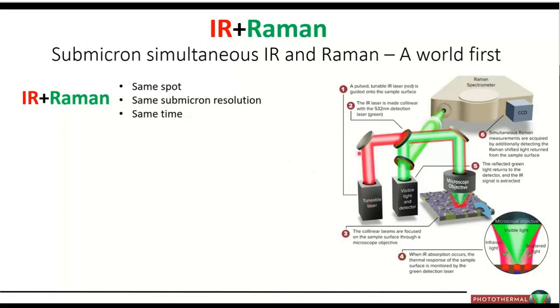And very quickly, I'll take you through the schematic here. So this is our infrared laser again. We shine that through our objective, this reflective Cassegrain optic that focuses the infrared down onto your sample. At the same time, as I mentioned before, we introduce the probe beam, a green beam typically, and we focus that down much more tightly, of course. Let's zoom in here. That's where that photothermal magic happens as we sweep through our wavelengths in our QCL, and that reflected green light we capture back.